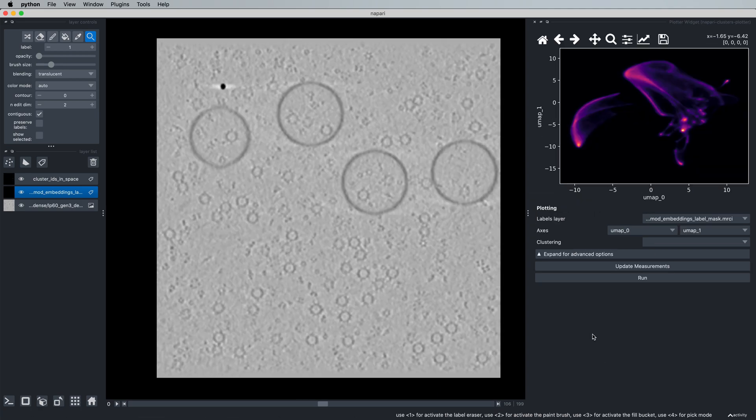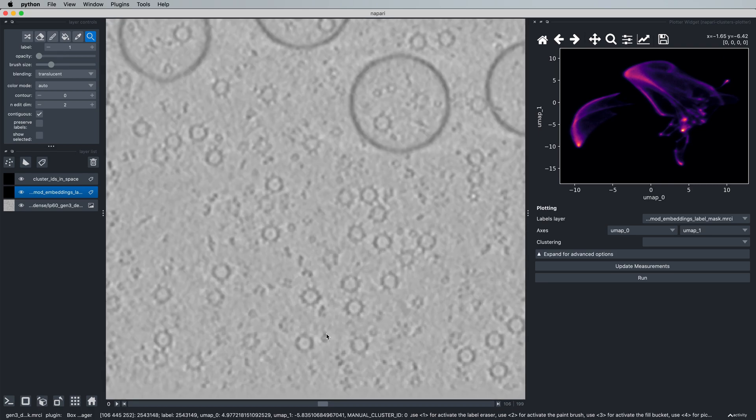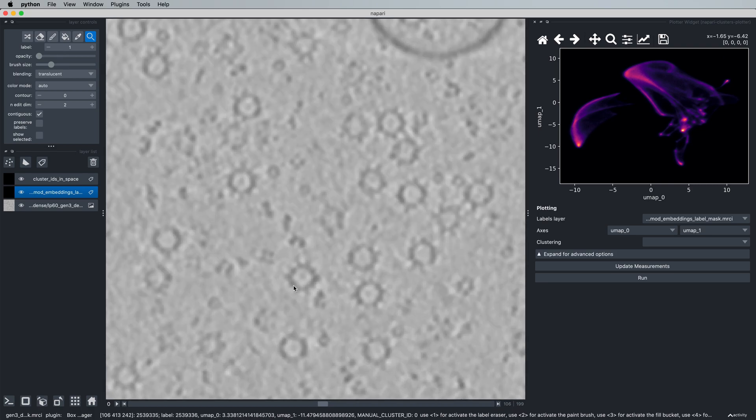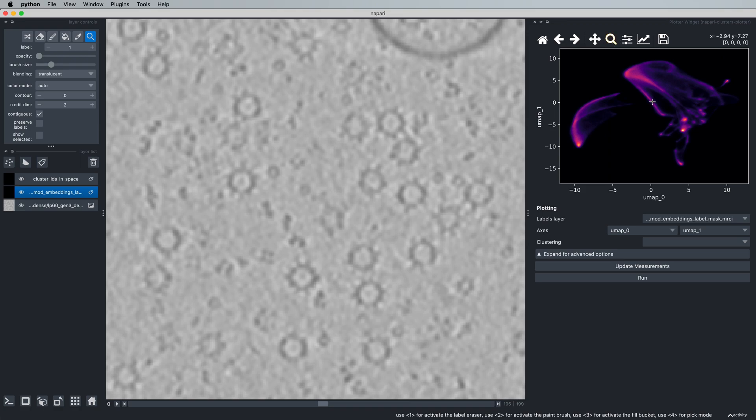The last thing I'd like to show you in this video is a quick tip for picking large proteins of interest most optimally. Let's say, for example, we have this large protein here, which we know corresponds to this elongated cluster down here.